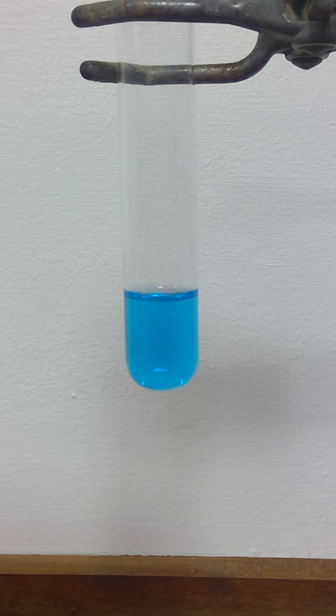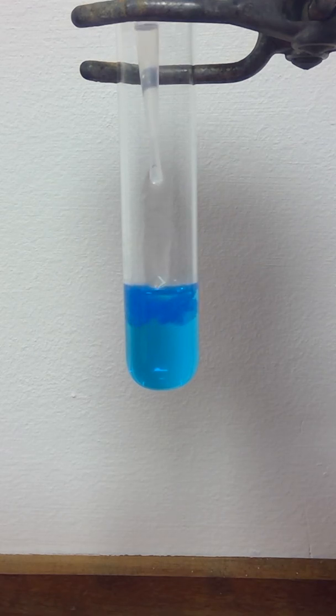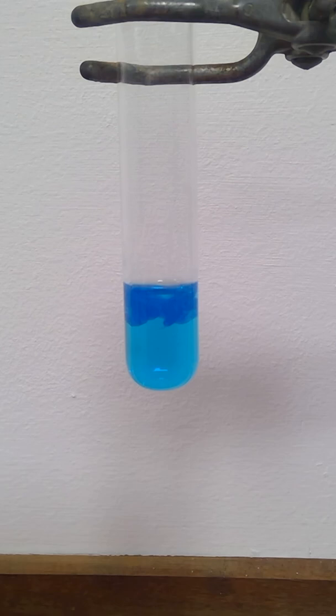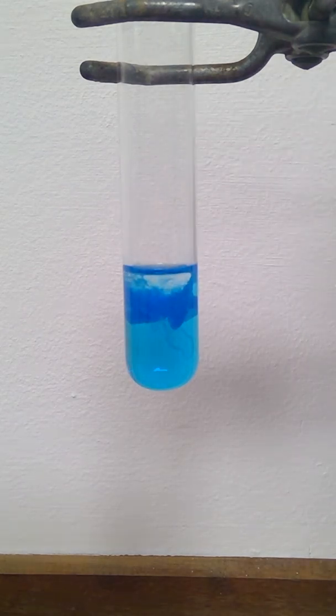Watch carefully as some drops of sodium hydroxide are added to the blue solution. Although not perhaps immediately obvious, a dark blue solid is formed. If I add a little more, more of that dark blue solid will develop.